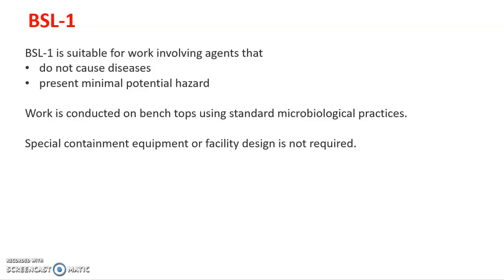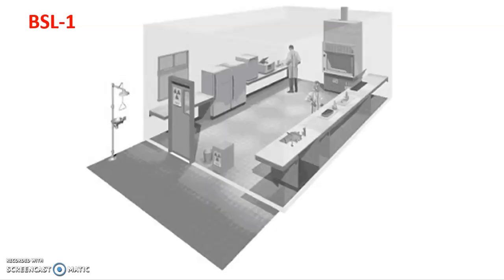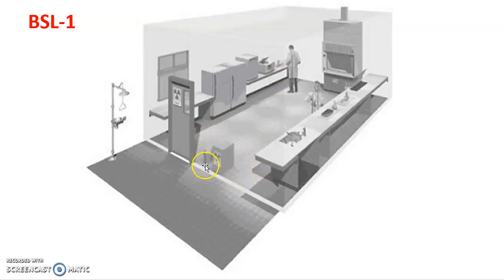BSL-1 is ideal for training people in microbiological techniques. When students are getting training in BSL-1, a supervisor must be present, and if they need any medical assistance, it should be provided immediately. This is the simplest laboratory facility design for biosafety level one — there is no autoclave, the person works on the bench top, there are two waste bins (one for ordinary waste, one for infectious waste), and biohazard labels are present.